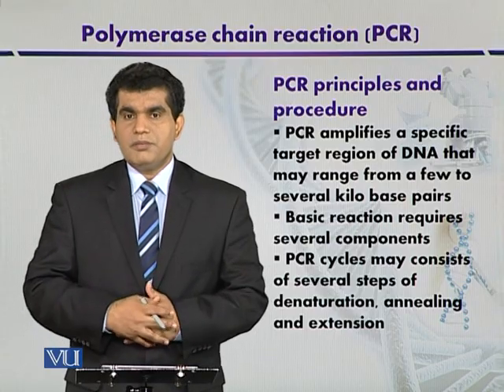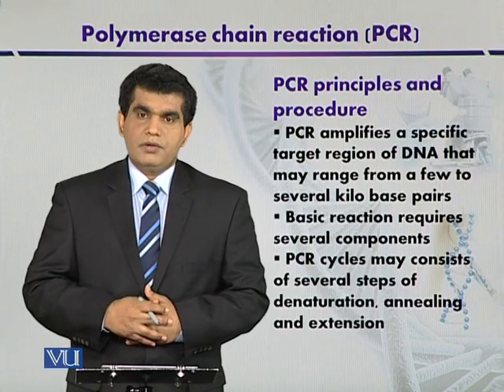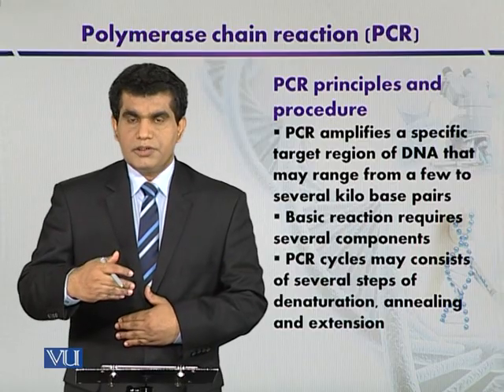So the yield, it may be affected. Now, with reference to reaction mixture where different components and reagents they have been incorporated.